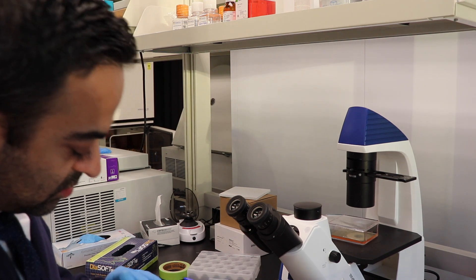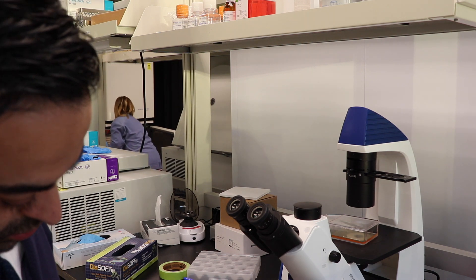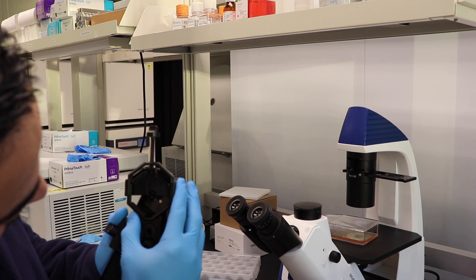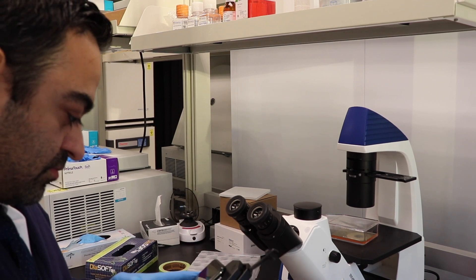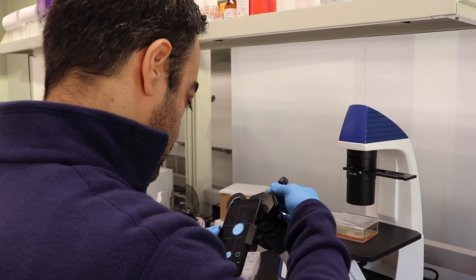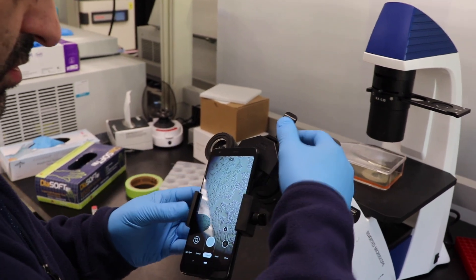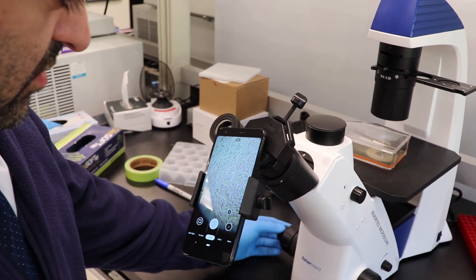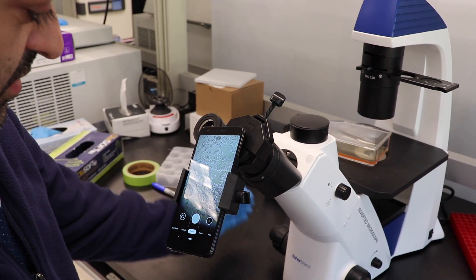We reach into our pocket, grab our phone, slide it into the phone holder, and fasten it. Then we align the camera, turn on the camera app, reinstall the assembly onto the eyepiece, and zoom in with the camera. You can see right through the eyepiece into the microscopic world, and you can move it around — the focus stays quite nicely.